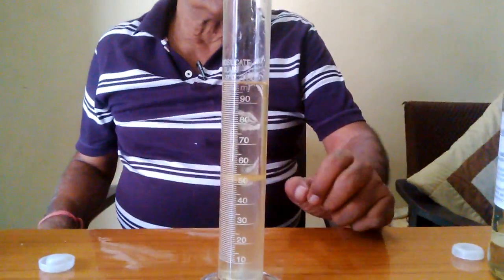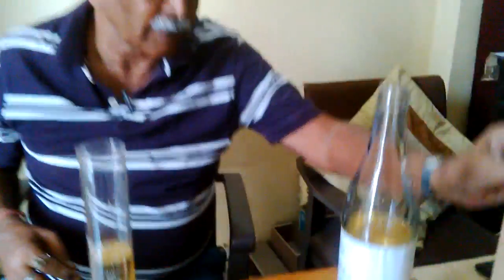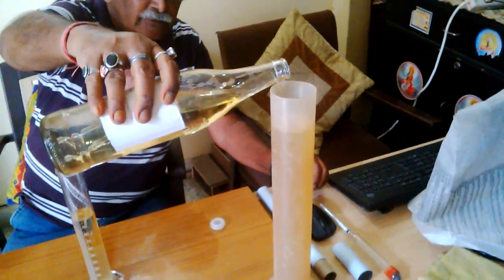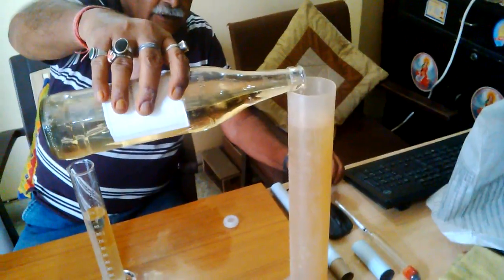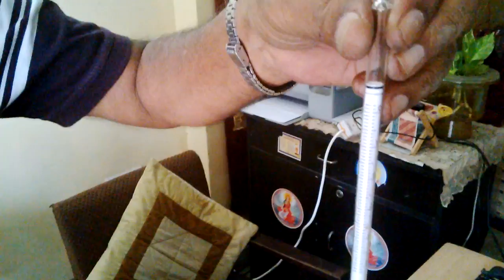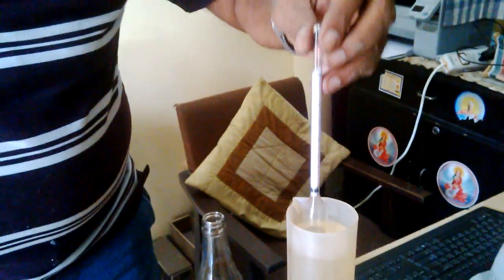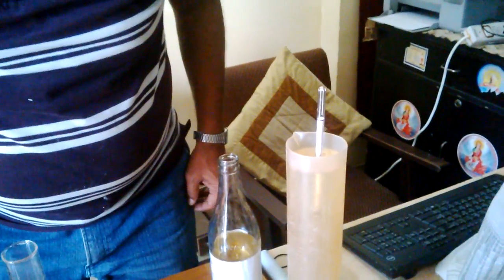Meanwhile, while it is settling down, we have taken 500 ml of this sample in a measuring cylinder of 500 ml capacity. We are using a hydrometer of the range 0.8 to 0.85 to find out the specific gravity of this sample.